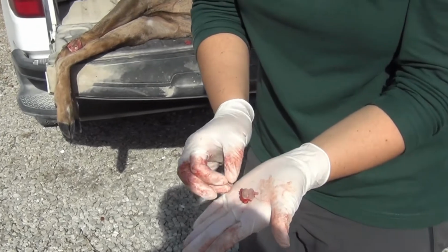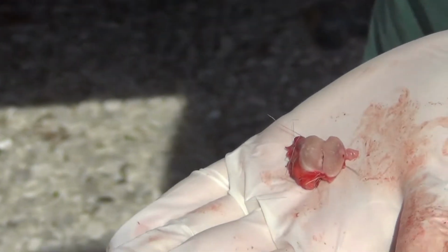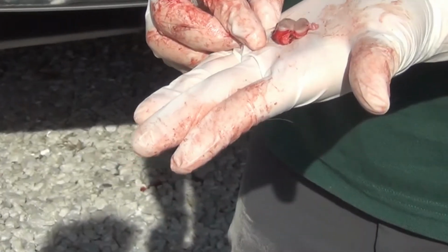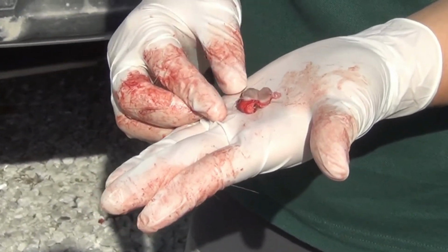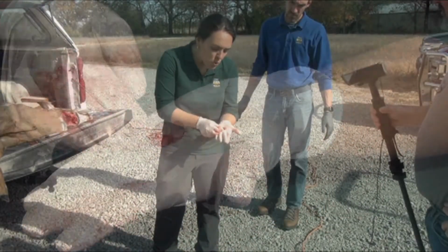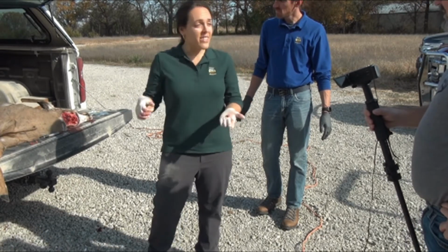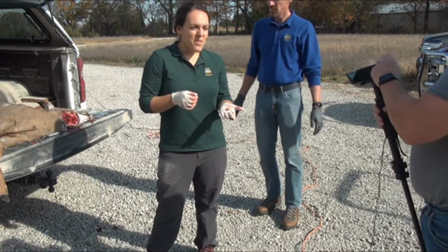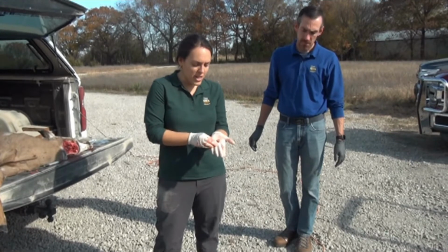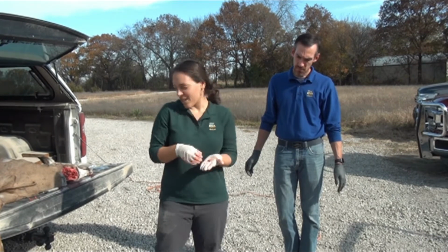This one's pretty uniform. Occasionally you'll even see pus or a sign of infection. That's nothing to worry about. That doesn't mean that there's chronic wasting disease or anything like that. It just means that it probably had a respiratory infection at the time of harvest. So that real uniform, smooth surface, that's what you're looking for to confirm that you have a lymph node. If we were to do this on the salivary gland, it would look like fat tissue, with that same fluffiness throughout, but you wouldn't have that same smooth, kind of liquid surface that we have on the cut section here.